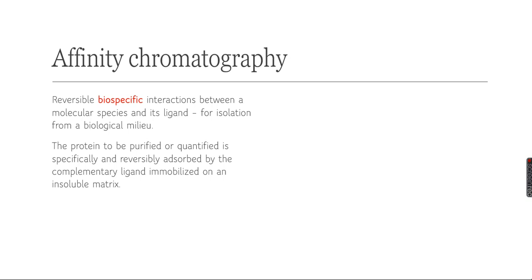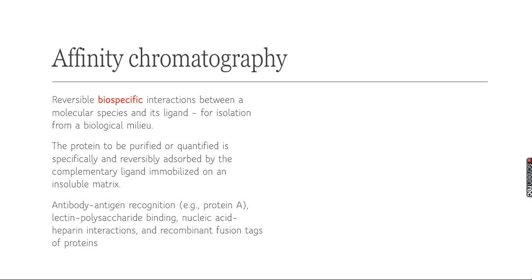We make it bind with a solid support, which is an insoluble matrix, and we load our sample. Those specific molecules which interact with the ligands will be retained, and all other non-specific binding will be cleared out. For example, antibody-antigen recognition can be there. Similarly, we can have lectin-polysaccharide binding, nucleic acid-heparin interactions, and recombinant fusion tag proteins can also be utilized in this process.